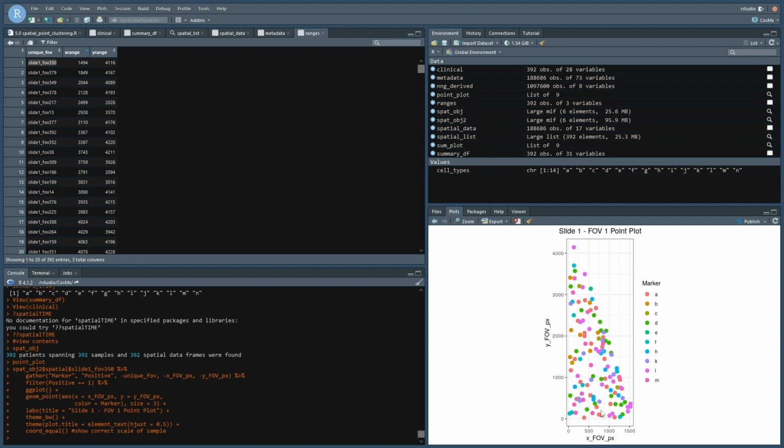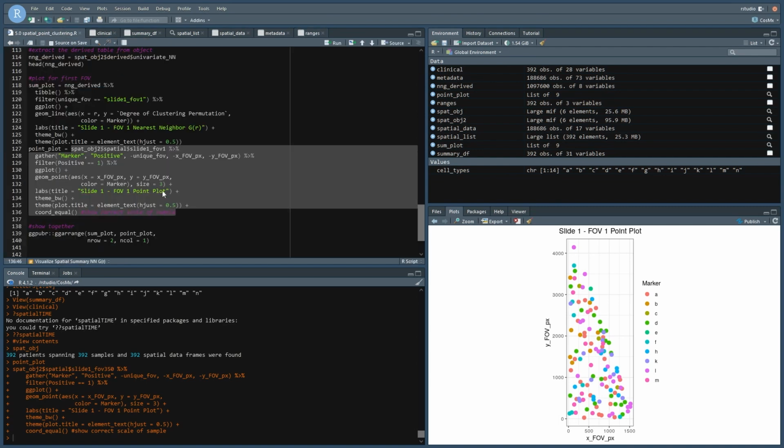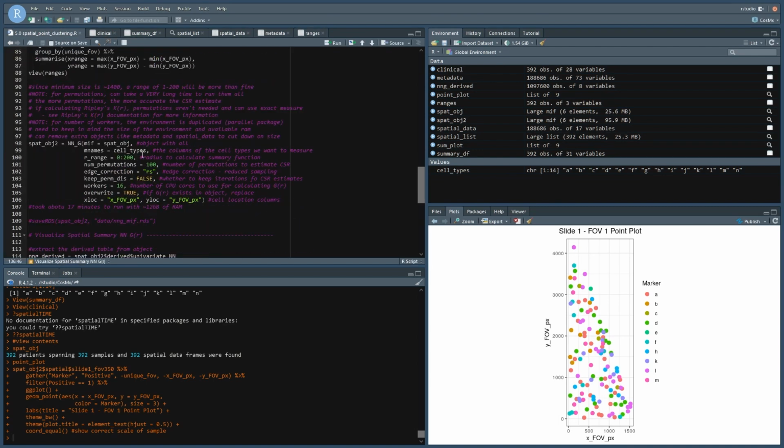We could do probably an R of 250, which means an entire search diameter around a cell of 500. So this cell here, it would probably look to 500 and then 1000. So we're looking at fairly close small scale clustering with an R of 200, which is fine.